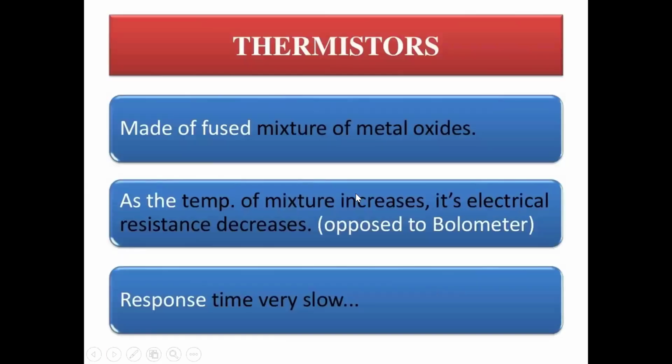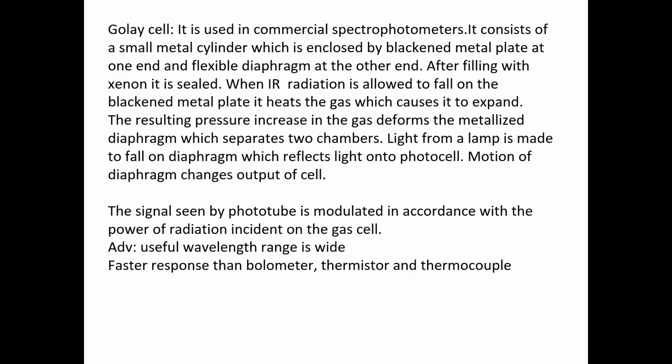Bolometer. Next one is thermistor. Thermistor lo fused mixture of metal oxides use చేస్తారు. As the temperature increases, electrical resistance decreases. Next, 4th detector is Golay cell.